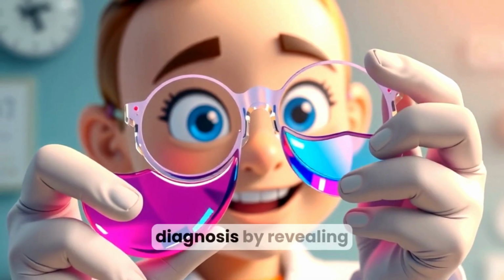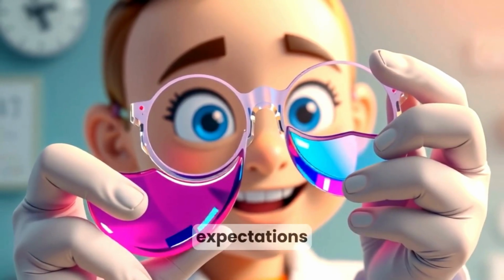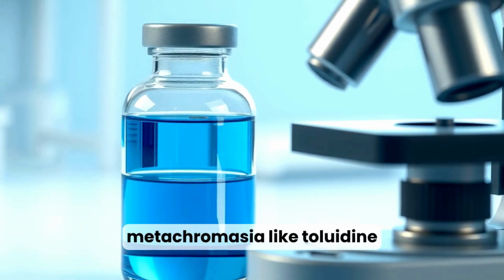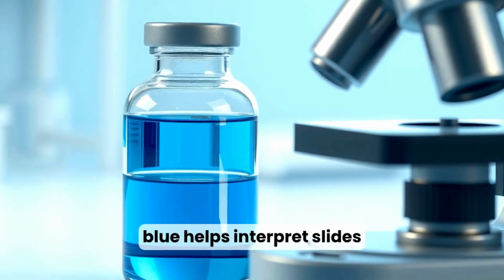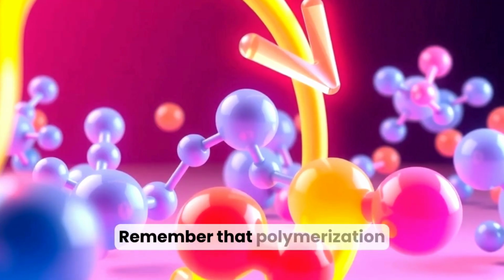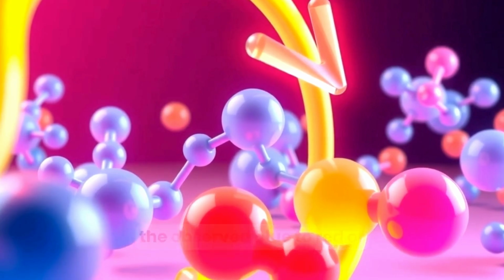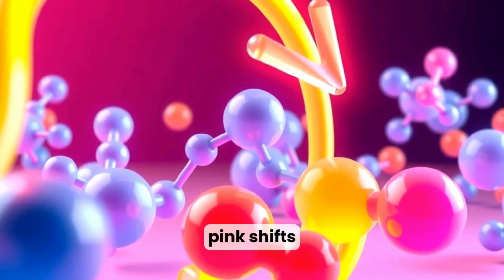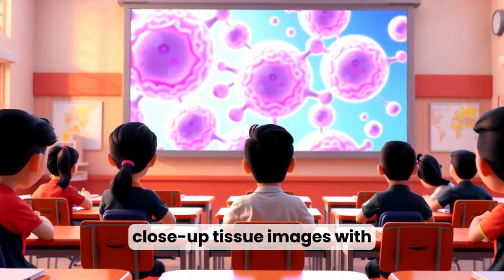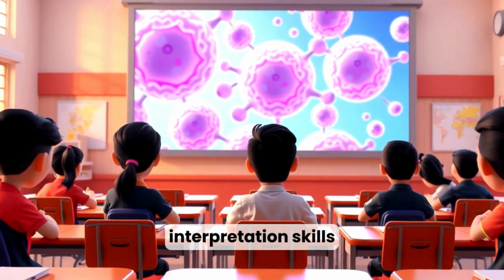Metachromatic staining aids diagnosis by revealing biochemical features not seen with standard color expectations. Knowing which dyes show metachromasia, like toluidine blue, helps interpret slides accurately and avoid misreading colors. Remember that polymerization and charge interactions, not new chemical products, drive the observed blue to red or pink shifts. When training or teaching, pair close-up tissue images with animated overlays and clear captions to reinforce interpretation skills.